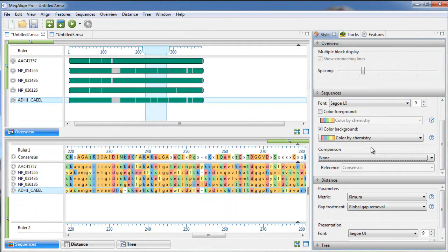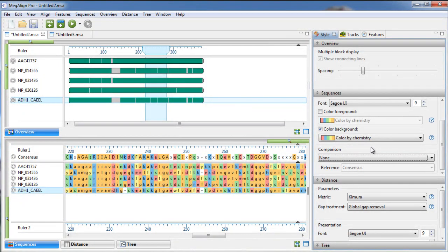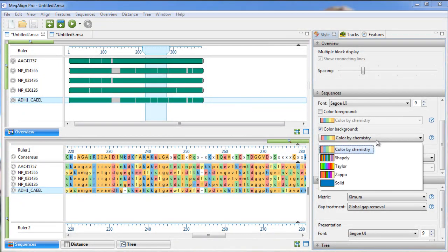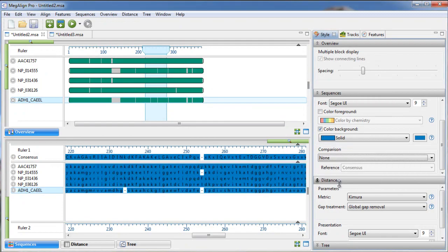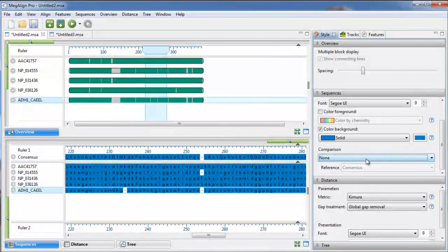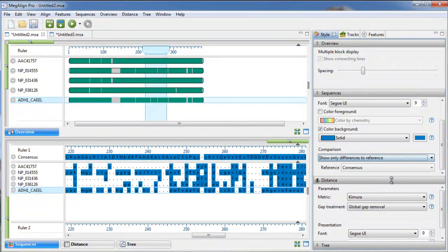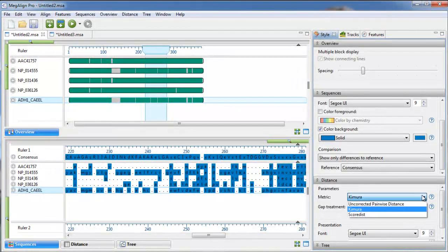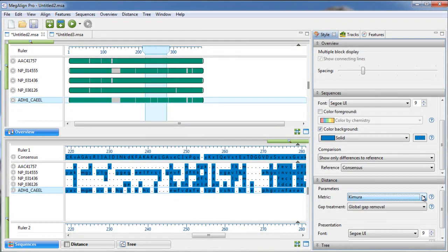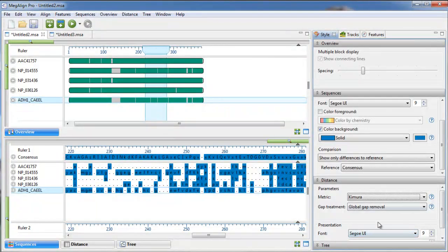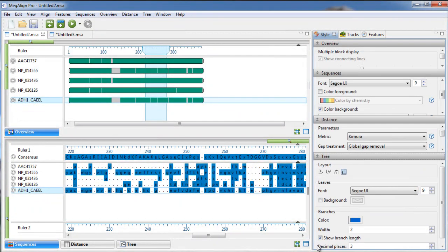You can customize the look of any of the Megaline Pro views within the Style panel. Here you can choose to change coloring, various metrics, fonts and font sizes, and more.